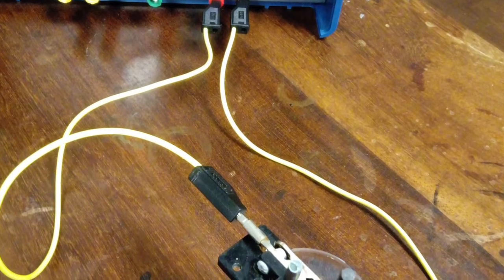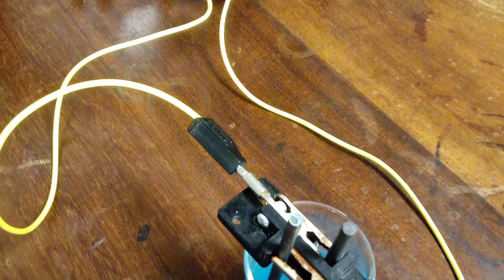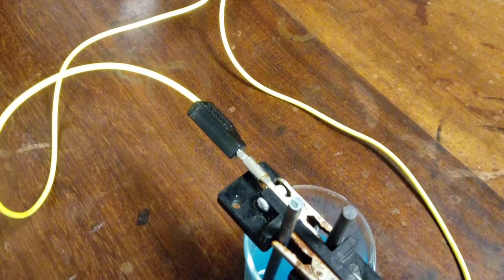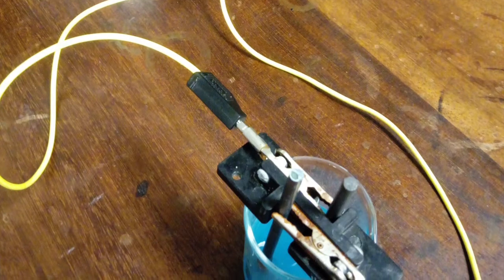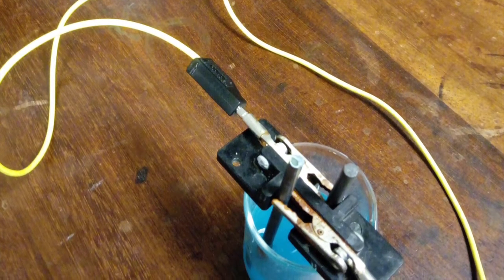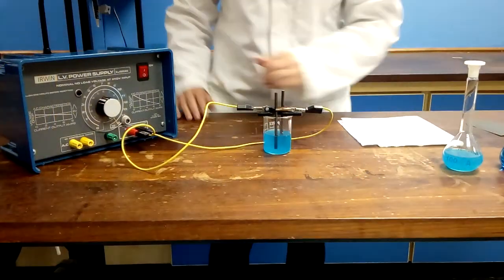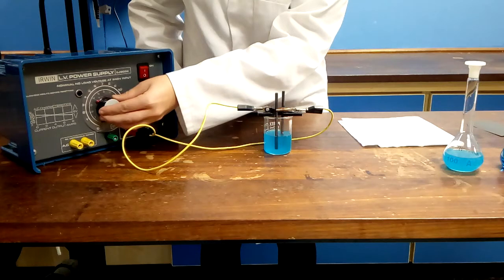The electrode connected to the red terminal is the anode. Here, the electrons are removed from the ionic solution. The electrode on the left of the screen is the negative cathode, and on the right is the positive anode. When you have set up the crocodile clips correctly, make sure the power supply is set to 4 volts.